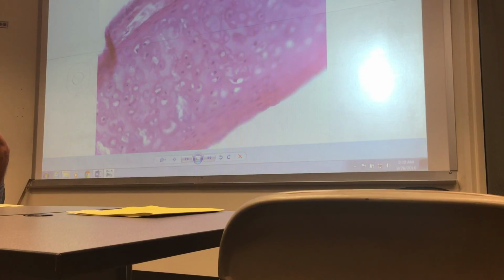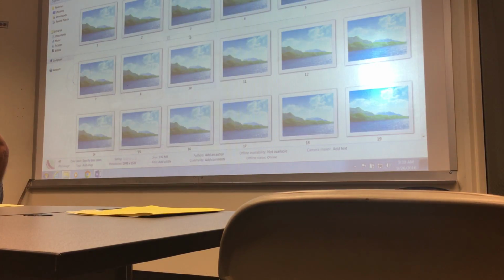Oh, we're going to have to go somewhere else. In other words, we must have been in the connective tissue section, and we need to be in the epithelial section, and I don't have any thumbnails, so I can't really continue. But, all right, I'll pick one.